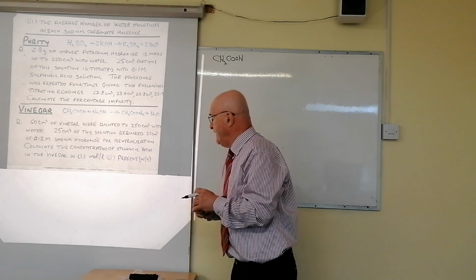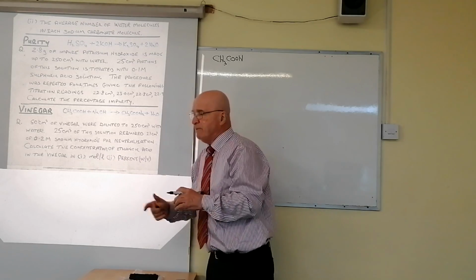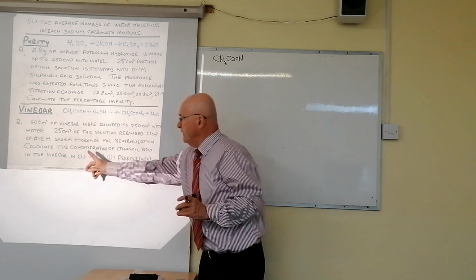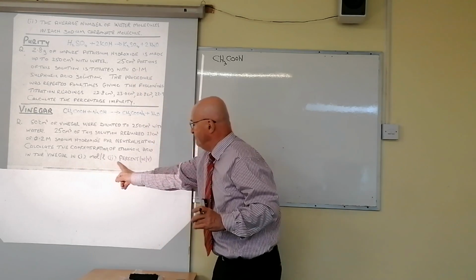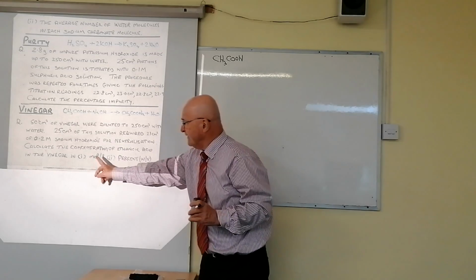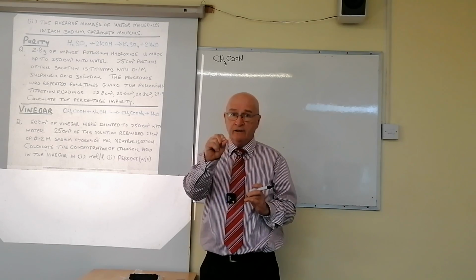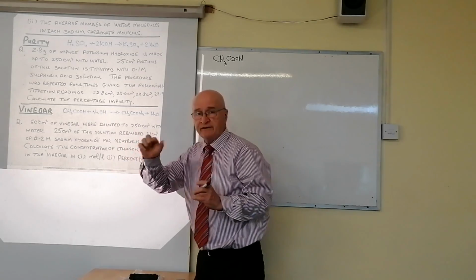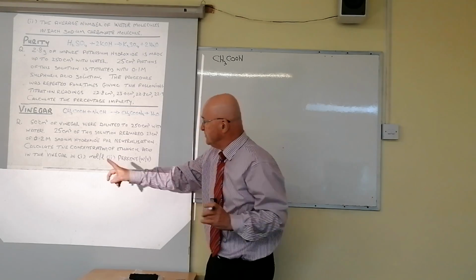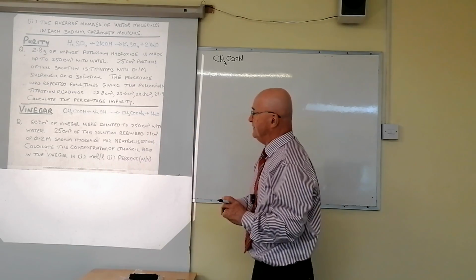And you're told to calculate the concentration of the ethanoic acid in the vinegar in moles per litre and in percent WV. Now, if you have this copy in front of you, I've already corrected it in class. That piece might have been missing and it needs to be corrected. Will you just check, please, that that is written on the copy that you have? It was an attachment that you got from me in the very last class we had here in Bruce College. So please make sure you've corrected that, that's the question you have there.